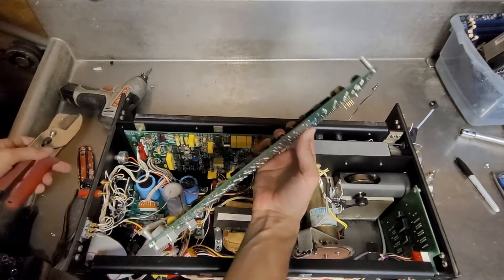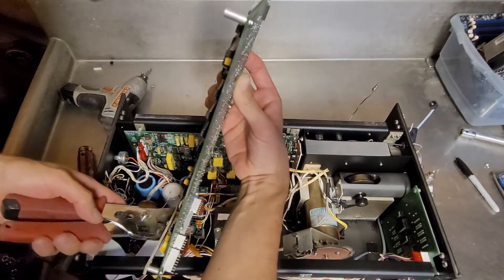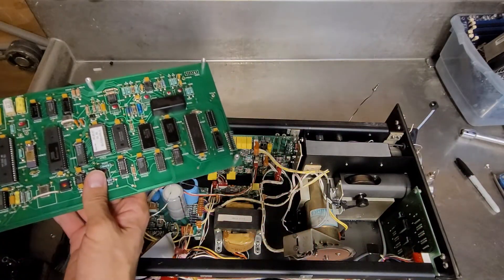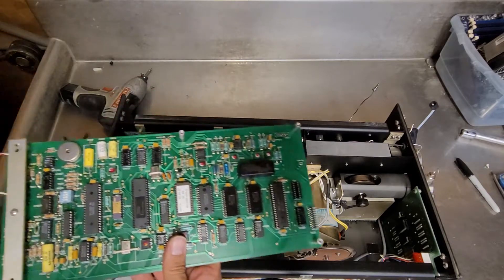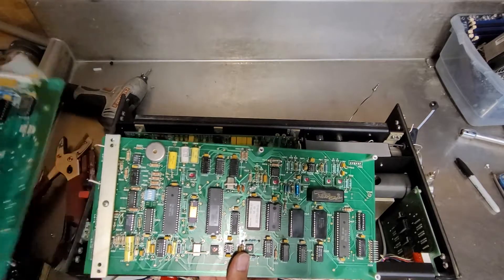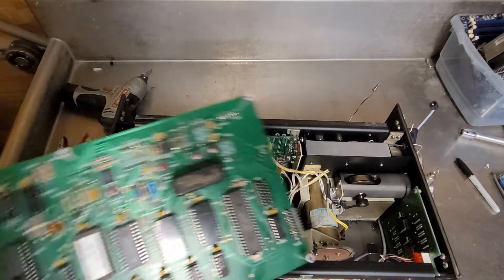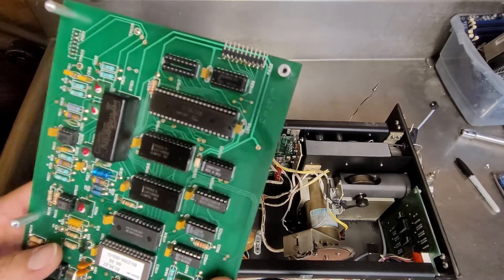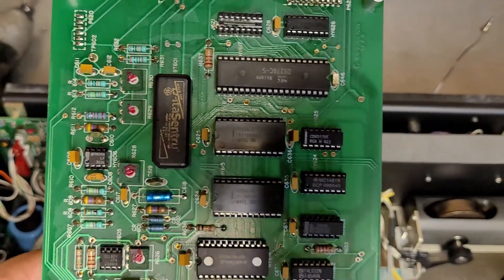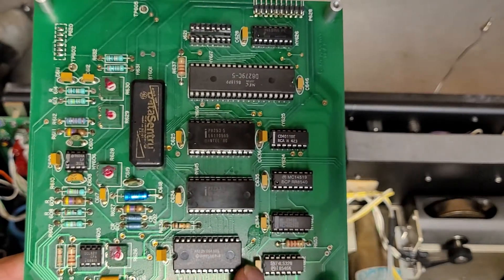A couple of bodge wires. So this is the PCB out of the other piece of ISCO equipment I tore apart, which is basically about half the size. I got some random Intel chips here. Sadly, I don't look this stuff up as I'm doing it, so it'd be up to you to look them up.